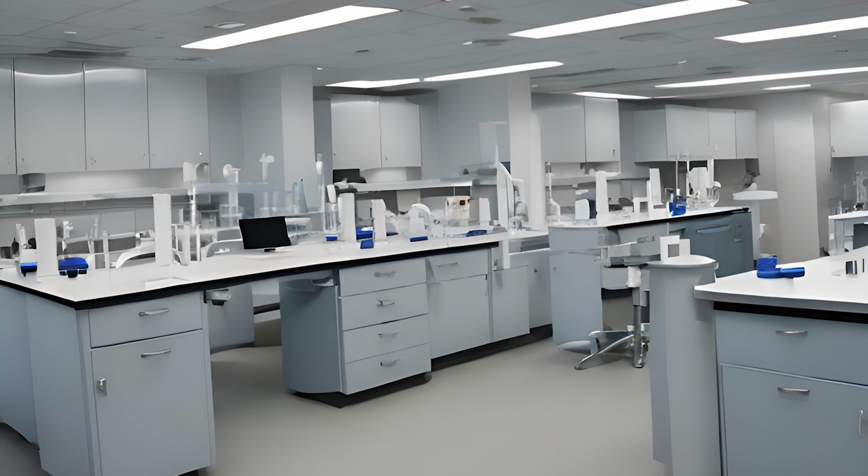Some of the safety equipment that you're going to have in your lab is an eye wash or face washing station, which will be available in every lab. Oftentimes, the lab is the best known location of the eye washing station, and other people from around the facility will know for sure that you have one, but they don't know where their own is, and they may actually come all the way across the building to use your eye washing station. That's how well known it is that labs maintain their safety equipment.